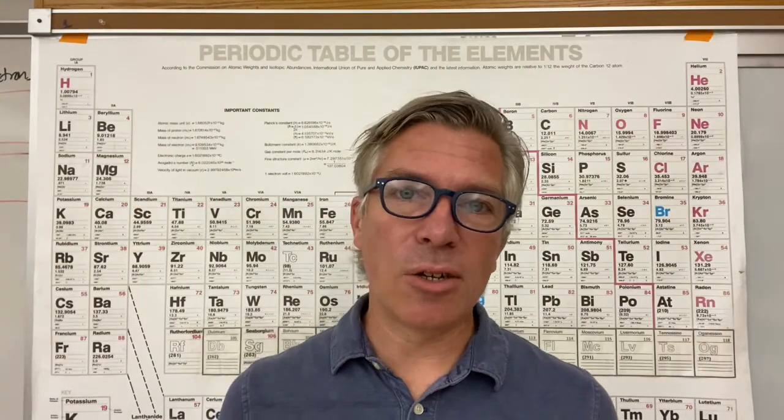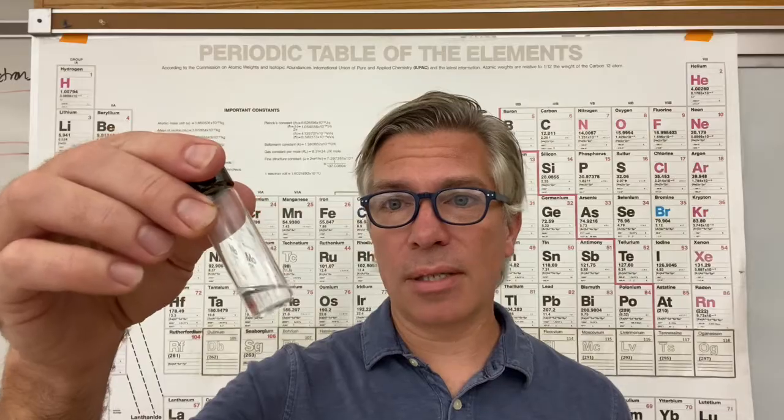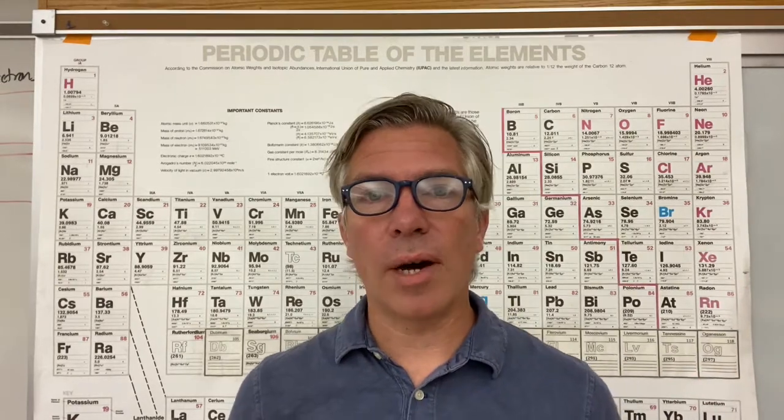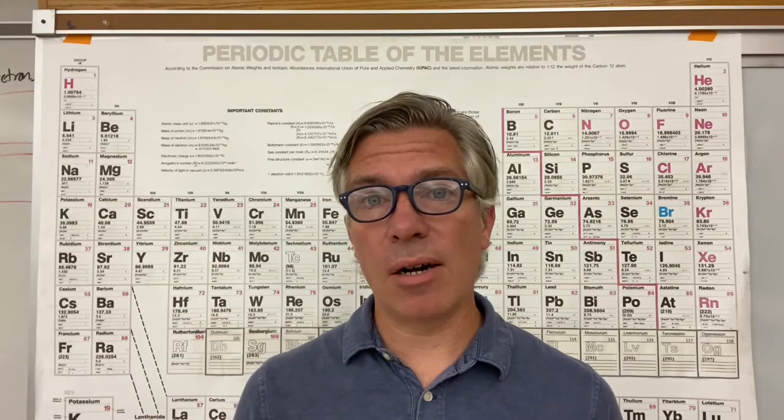There are many tests that could be done to try to determine what a substance is. In the case of this substance, I know that this substance is a volatile liquid. A volatile liquid is something that easily evaporates under normal conditions, especially those below the boiling point of water. So I can make use of its tendency to easily evaporate to try to figure out the molar mass of this substance, which will help me identify the substance. I can do it right here in this lab, and in a few minutes, so can you.